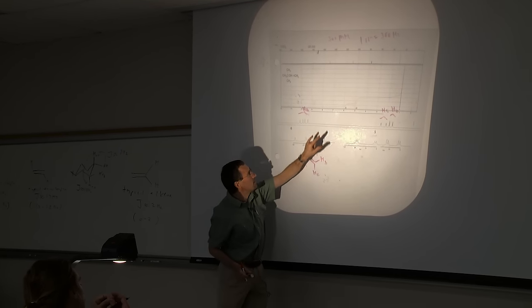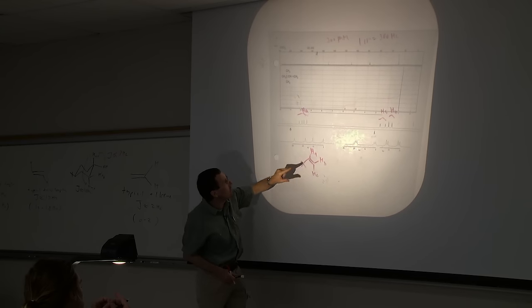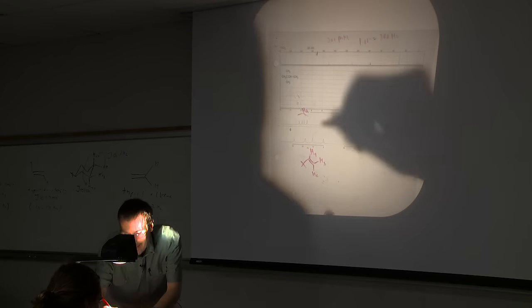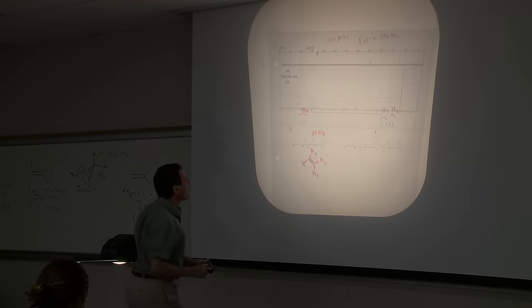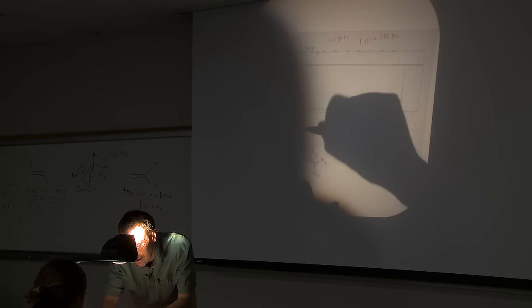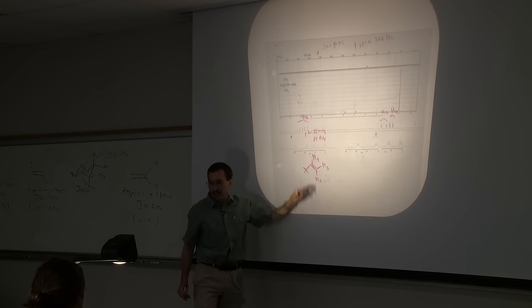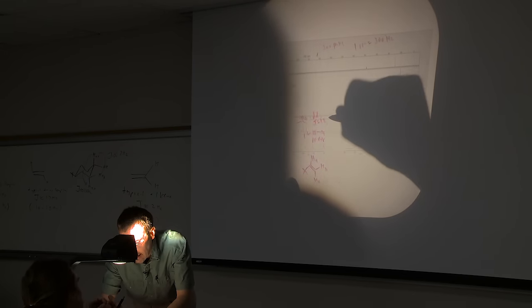And then what I did here was continue. I manipulated the scale to make it into a little ruler accurately. And so we can read off our hertz values. You can see the difference between line 3 and line 4 is 11 hertz. And the difference between line 2 and line 4 is 18 hertz. And so we're able to actually measure our coupling for HA. And HA is a DD, J equals 18, 11 hertz.